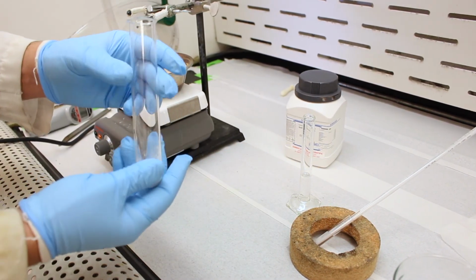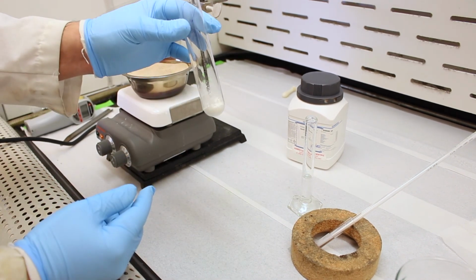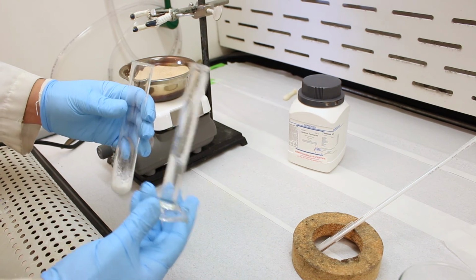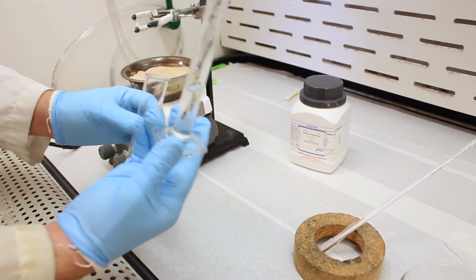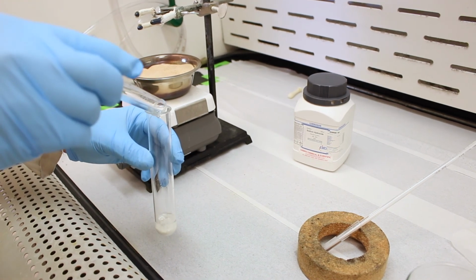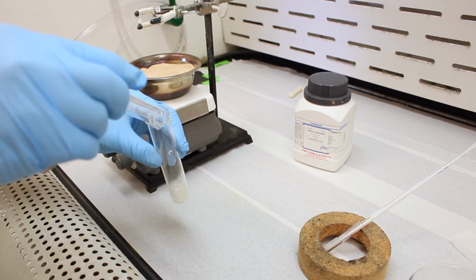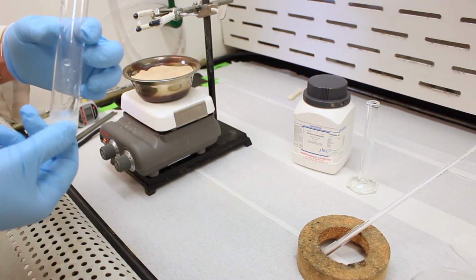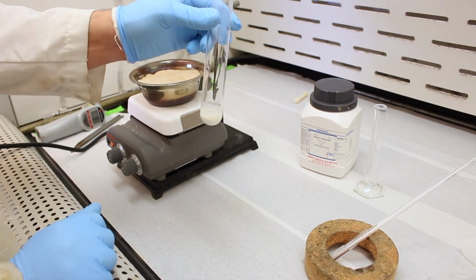Okay, so now we have our reagents combined in our test tube, and now we need to add our solvent, which is diethylene glycol. It's a very viscous liquid. So we have 4 milliliters here, and this is the solvent for this experiment. Okay, so we've added our solvent, we've added our base, and we have all our reagents necessary.